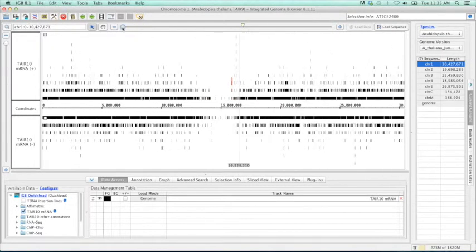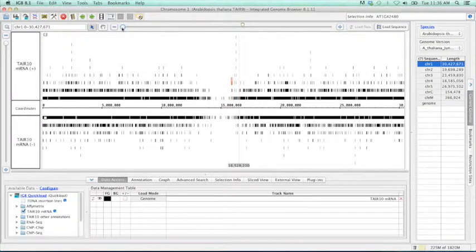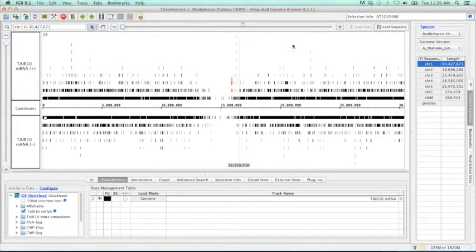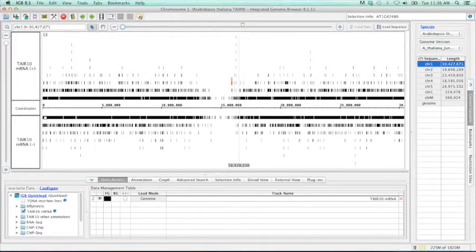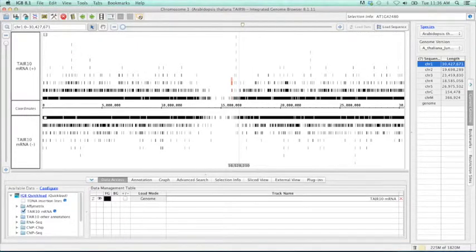Or my favorite, which is just to hold the option or alt key, which will automatically switch you to the grab function. As you'll notice, we have very smooth zooming in IGBI. This is something we're very proud of and works very well.